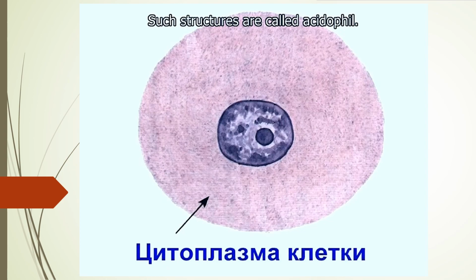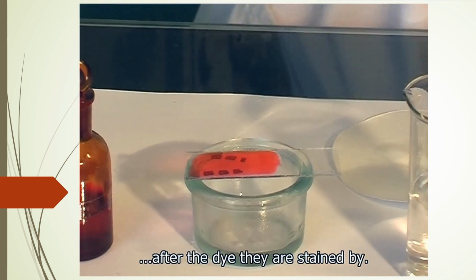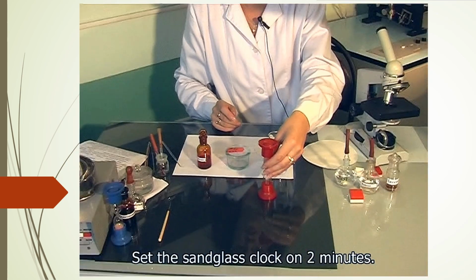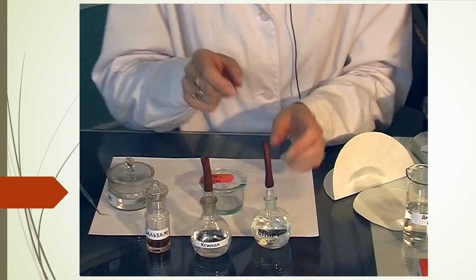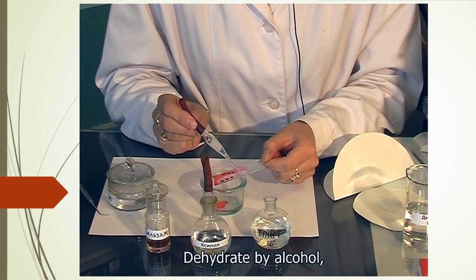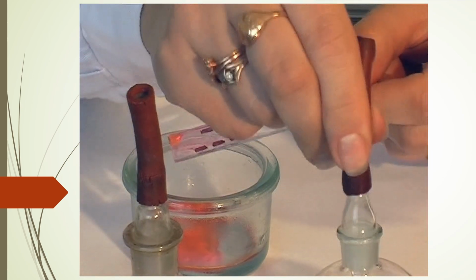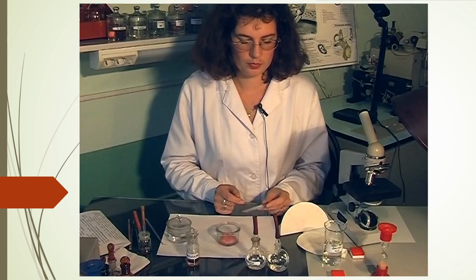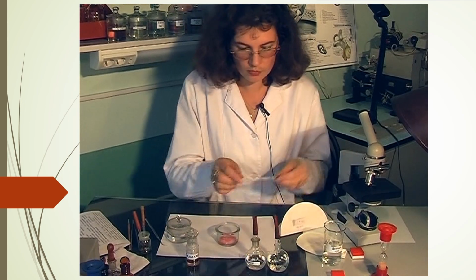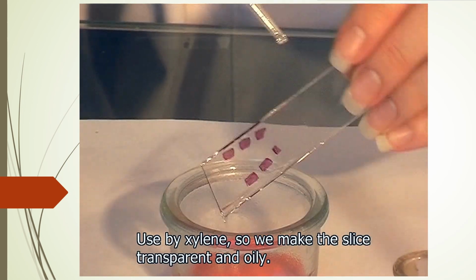Some histological structures have got their names after the dye they are stained by. For instance, blood cells, eosinophil cells. Set the sandglass clock on 2 minutes. Then pour out. Dehydrate by ethanol, then dry it. Use xylene, so we make the slice transparent and oily.